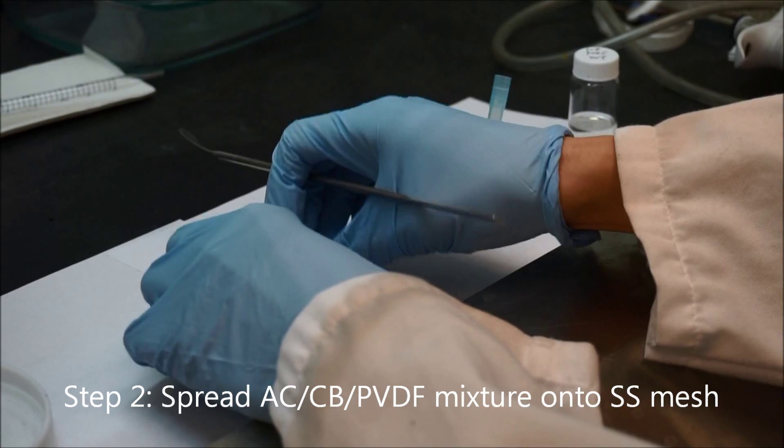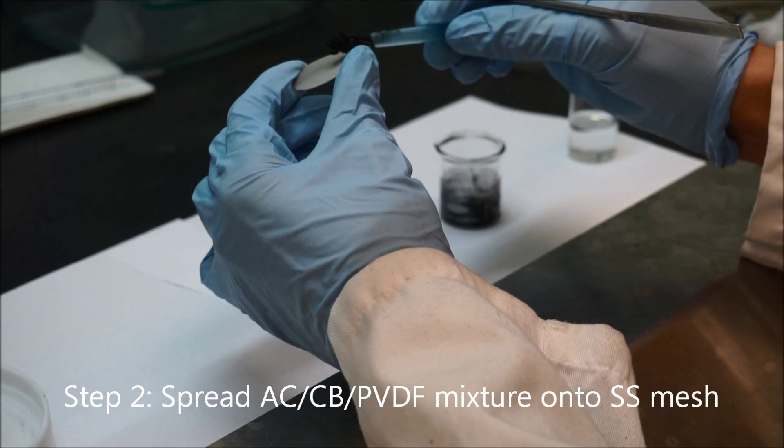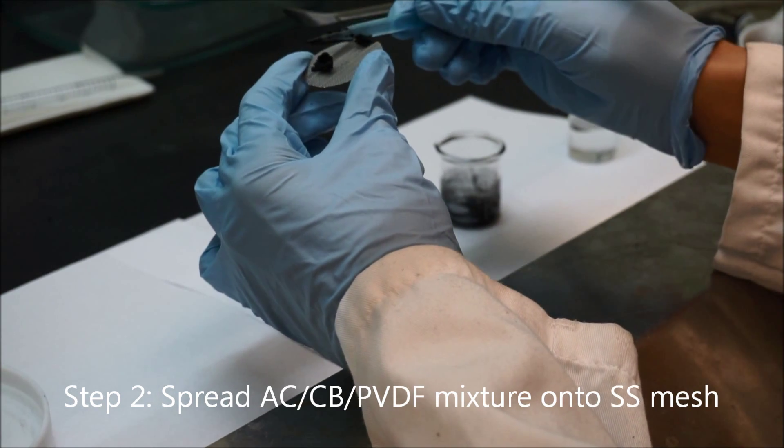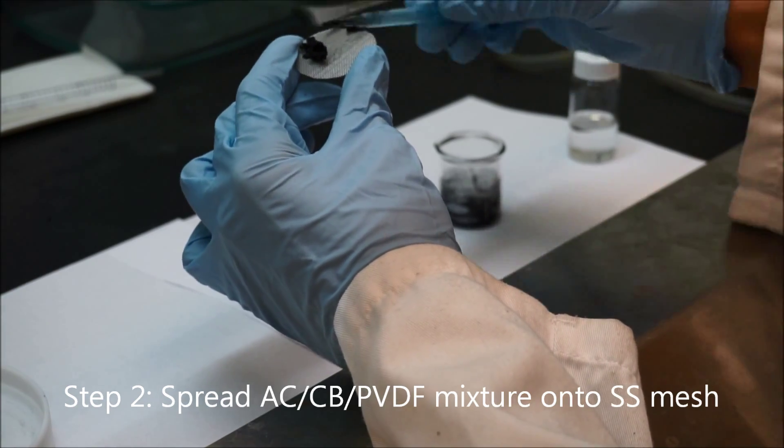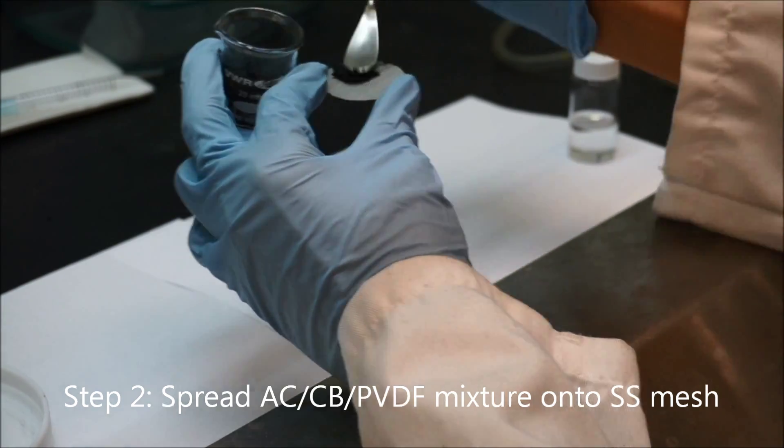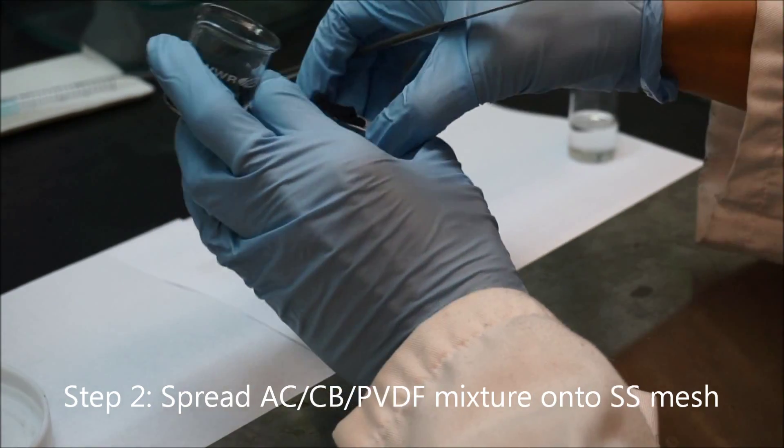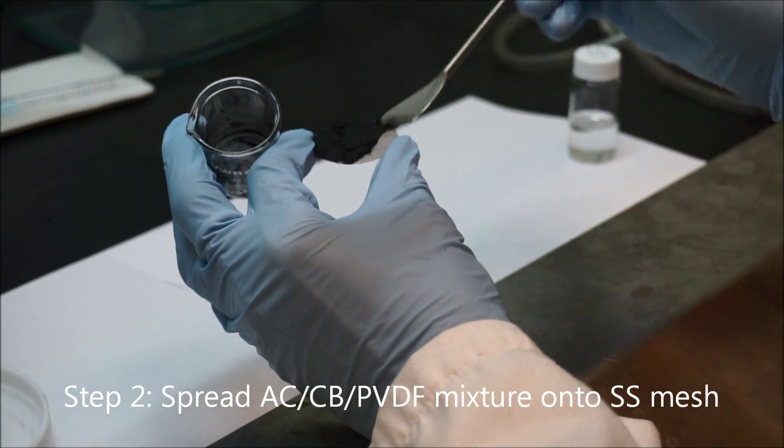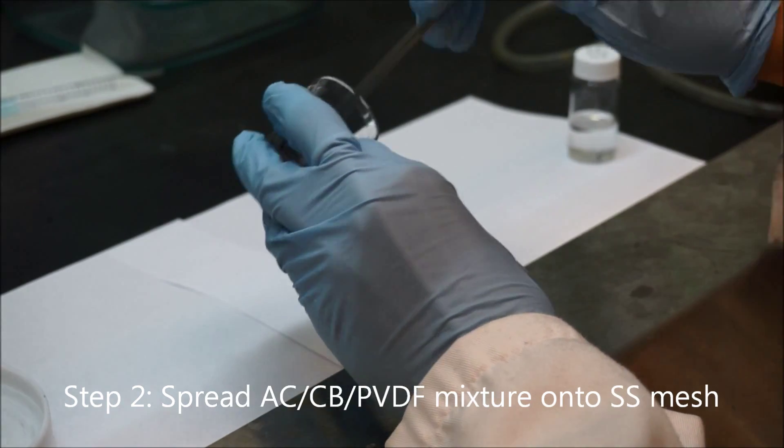Then the second step is to spread the active carbon, carbon black, PVDF mixture onto the stainless steel mesh. Here we use a spoon to quicken this process. It might take 30 seconds to 1 minute to finish this process, and it depends on how fast you can do it. Do not exceed 2 minutes to finish the process.